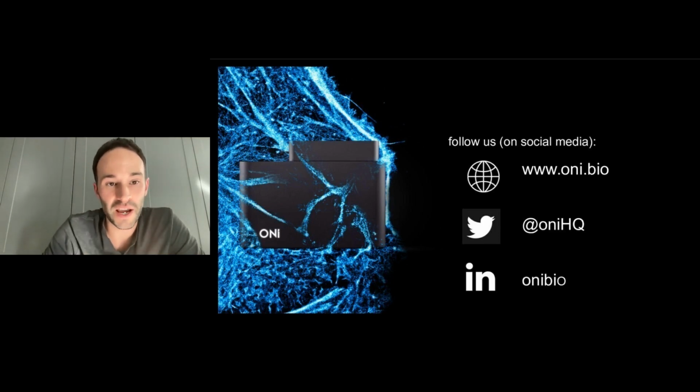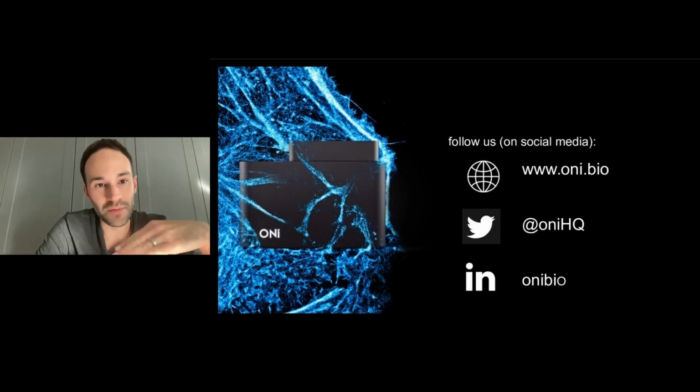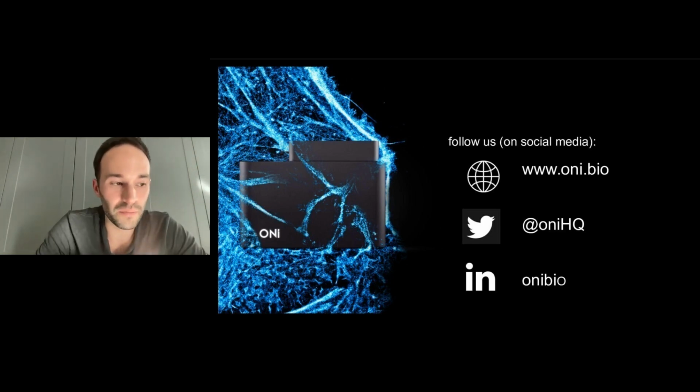But the STORM buffers have within them a dark state stabilizing agent, which essentially pushes the molecules from being fluorescent to dark, but not bleached. Because the transition from fluorescent to dark is reversible, so it will come on and off and therefore blink, whereas fluorescent to bleached is irreversible, so it's off forever. So it stabilizes that, and therefore you get blinking. It also adds to the photostability of the molecules, and so you can image much longer without them bleaching.